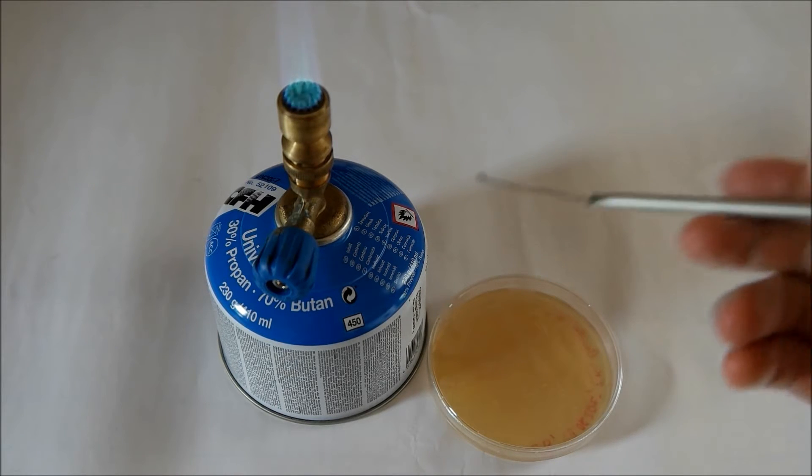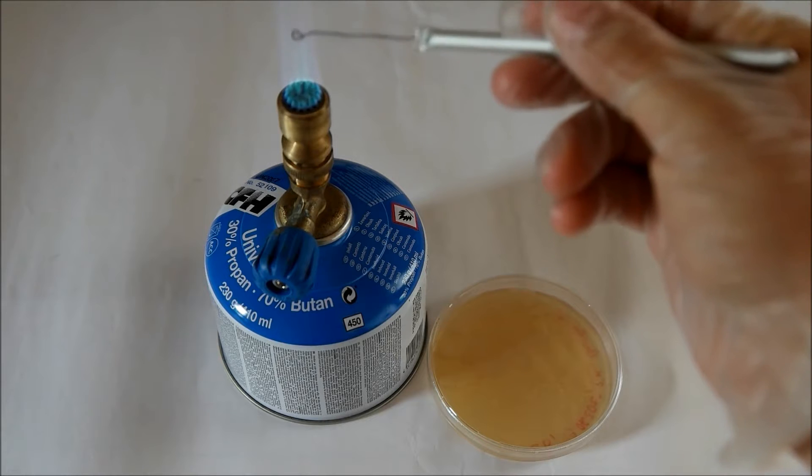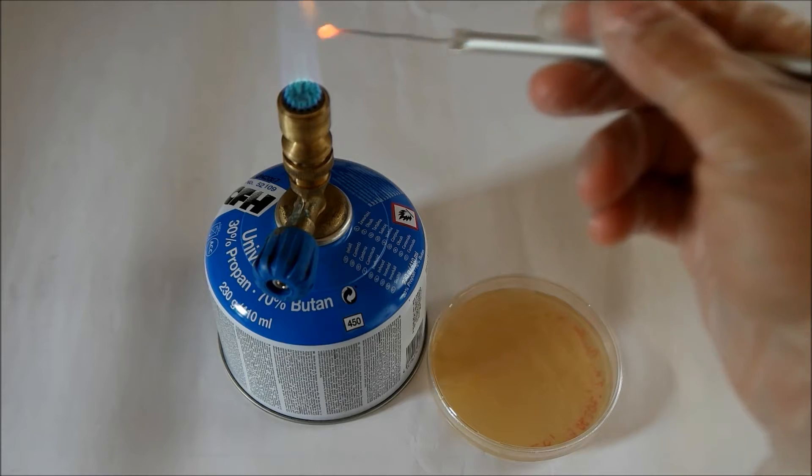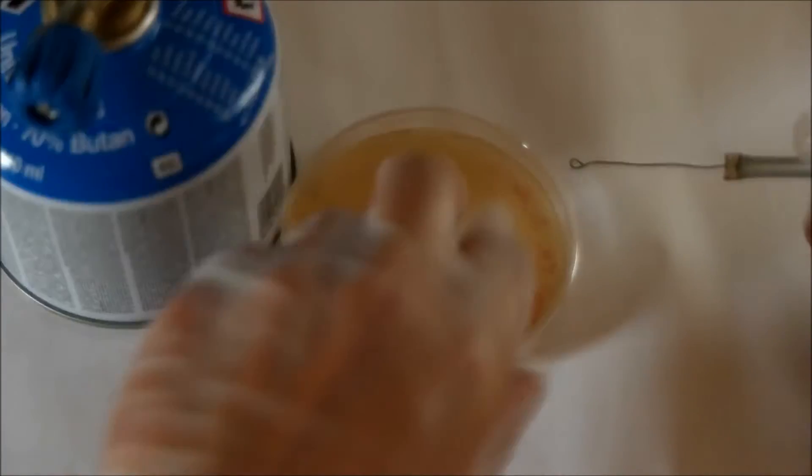First of all, you have to let your inoculation loop glow to make it free of bacteria. I'll take some bacteria out of the agar plate.